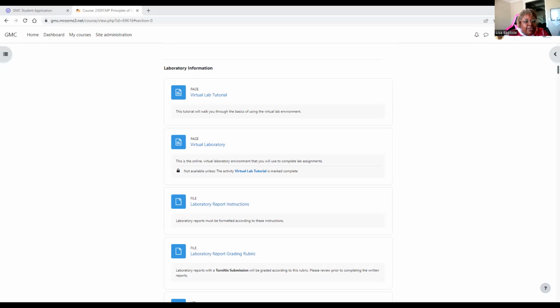Another way that you can read the volume is directly. And so when we're reading the volumes, if we close this out, you see how the graduated cylinder is just sitting there with the liquid. You can right click on it and click on detail view, and then it'll bring it right back up. And so we have 4 point, each of these markings in between the 4 and the 5 or any of the numbers is 0.2. And so we have that the bottom of the meniscus, or the bottom of that smiley face, is between 2 and 4.